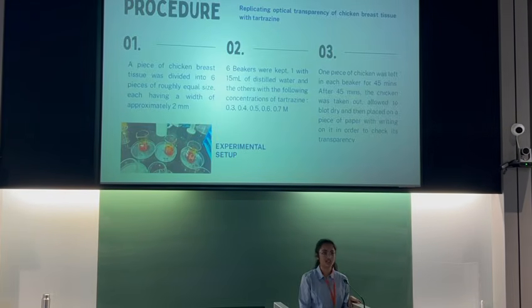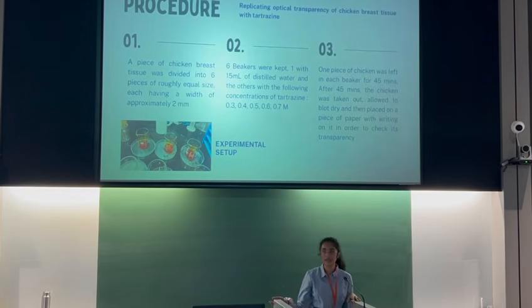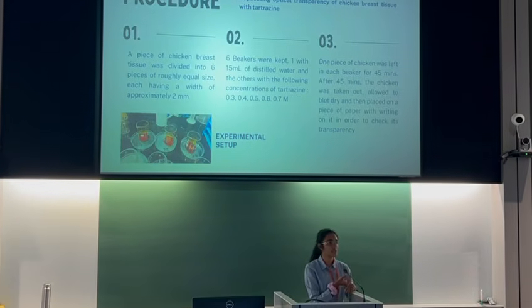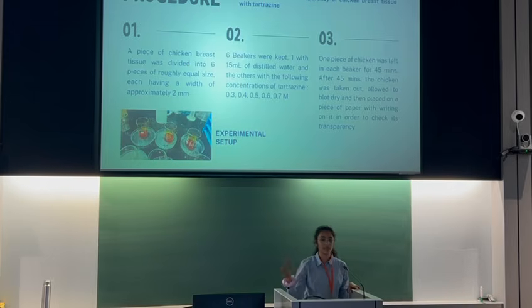So first was the positive test. We basically had 6 beakers of tartrazine solutions with 5 different concentrations and 1 control. The control was distilled water, and we kept concentrations of 0.3, 0.4, 0.5, 0.6 and 0.7 molar tartrazine.